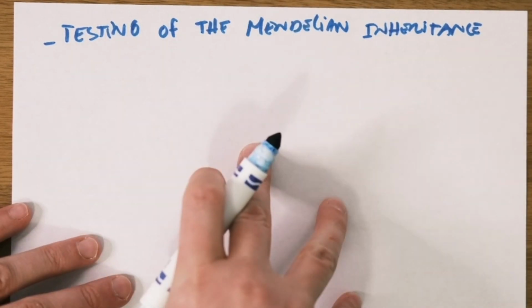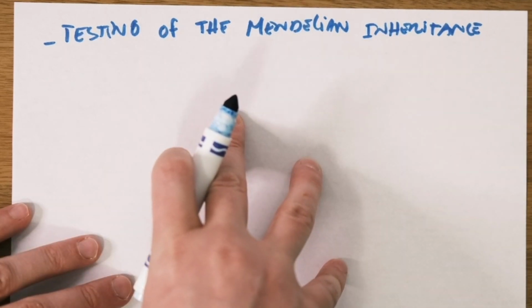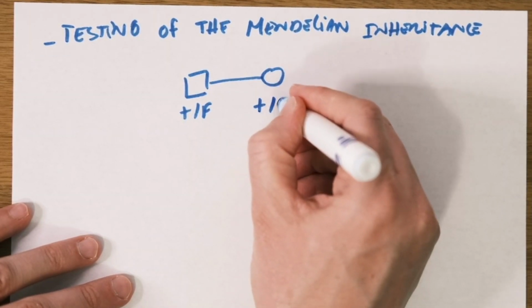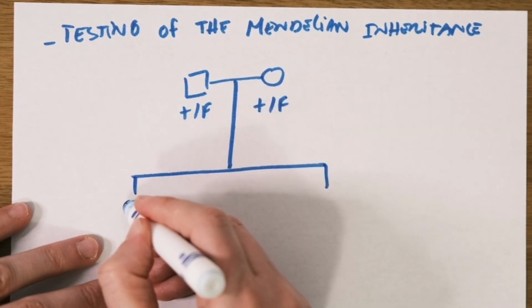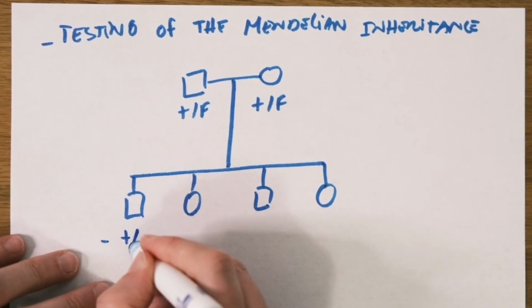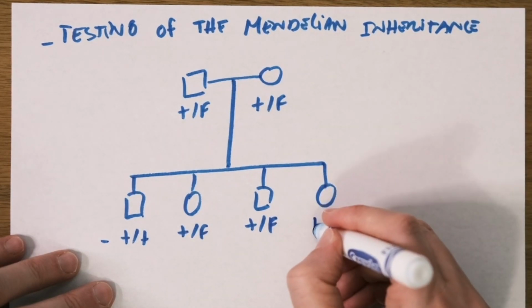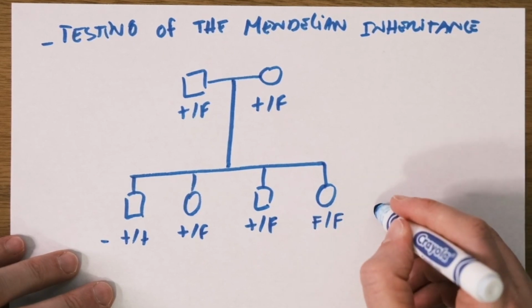So you will cross your founder to the F1, and then the F1 you will cross again with black 6 animals, and at a certain point you will have a couple of quite distantly related heterozygous animals for your Flox. So you will cross these two, and here you are expecting 3 types of phenotypes. Here the sex doesn't matter, it could be anything, but you typically have 1/4 of the animals being wild type, then half of the animals being heterozygous for the wild type and the Flox, and then 1/4 should be Flox. So this is what we want to see, and we want to see this in a 1/4 situation.